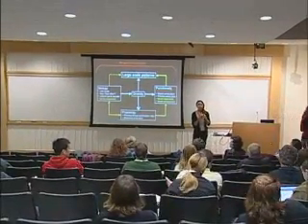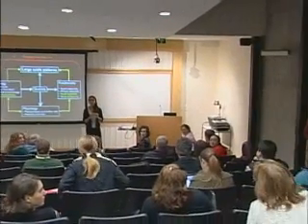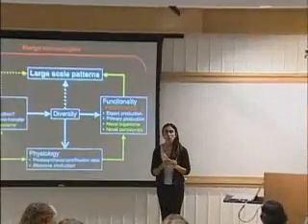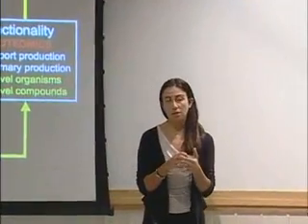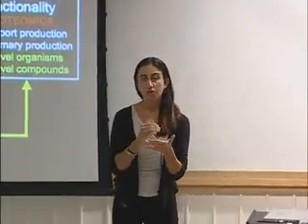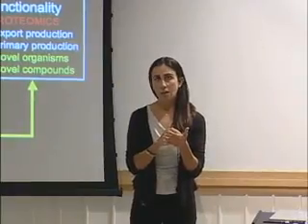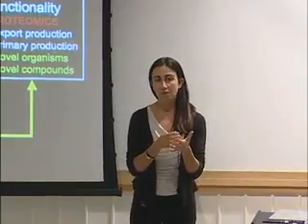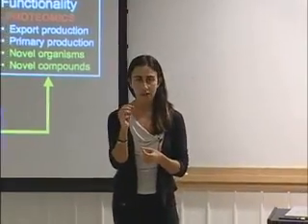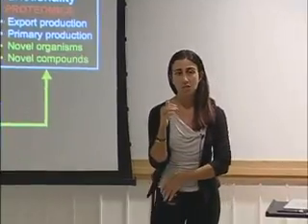How does working with non-axenic cultures confound your interpretation of proteomics results? Well, with proteomics, you only pull out the most dominant proteins. So if you keep the bacteria levels really low, the chances of getting a dominant protein from biomass, which is orders of magnitude lower than the actual eukaryotic culture, is very unlikely.